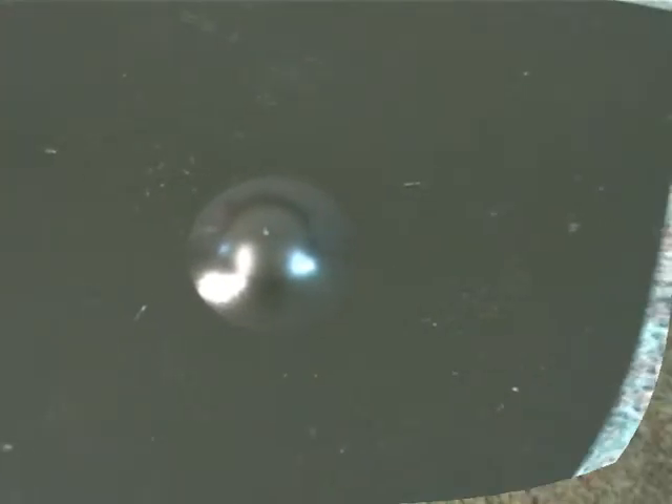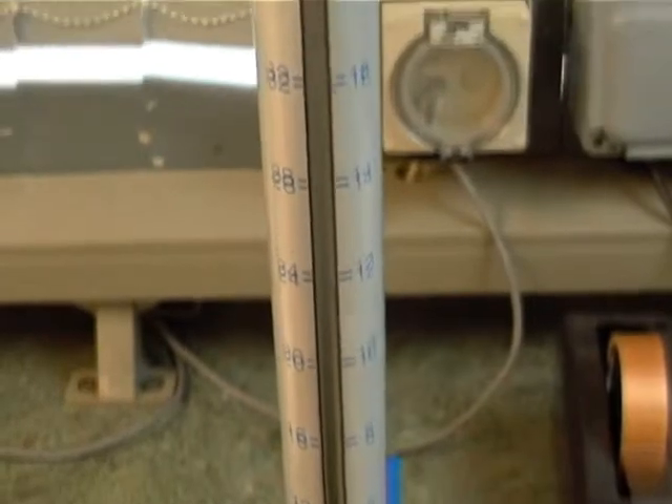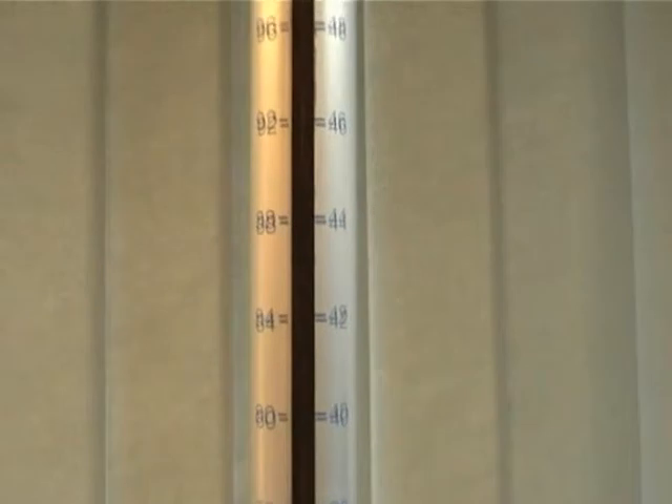The indentation is usually formed from the rear of the panel by dropping a pre-defined weight from a given height. A special instrument is used with graded markings to ensure that the required force is applied in forming the indentation.